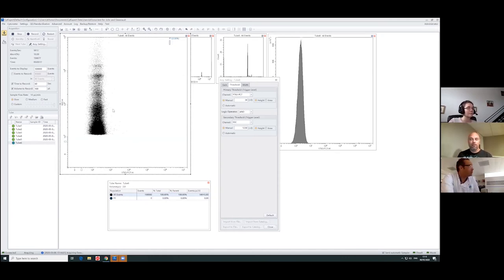A third point that I like is he said you can start to play with things. It gives you lots of freedom. I'm a tinkerer, right? I like to touch. I like to get in and move things around, whether it's software or hardware. So that is incredible. And the reason I say hardware is because at some point we are going to talk about this wonderful thing called violet side scatter and how easy it is to transition over to that and get a better separation and more dynamic range without sacrificing any of that noise floor. You're not adding anything else. If anything, it's getting a little bit better when you stop playing with different scatters that you have available to you.